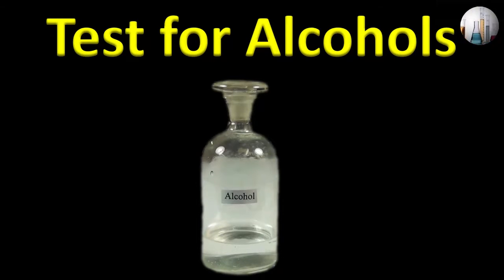Hello and welcome to this video series. In this series, we'll be presenting various experiments in chemistry. In this particular video, we'll be explaining and demonstrating for you some simple tests for alcohols.